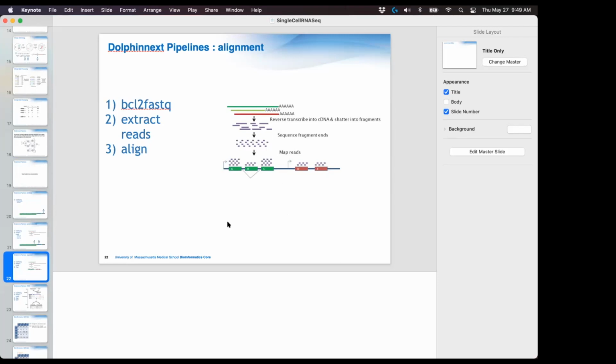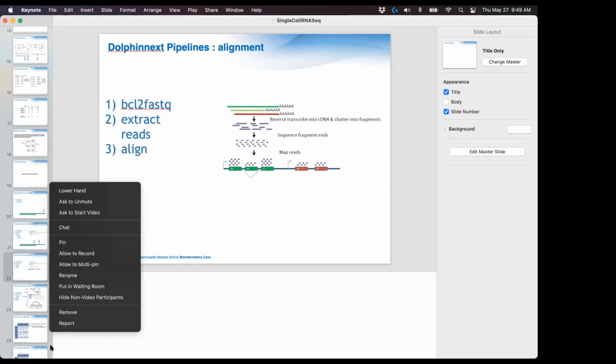But you bring up a good point that ties into Alper's question, which is that in general, these single cell techniques are usually biased to the 3' or 5' end. So if you're looking at particular isoforms in a disease state, single cell might not be the best for that, because you're usually not getting full transcript coverage. There are some methods out there that do give you full transcript coverage, but if you're going to plan that type of experiment, make sure you can get full transcript coverage if you need it. I saw, I think, one more hand raise.